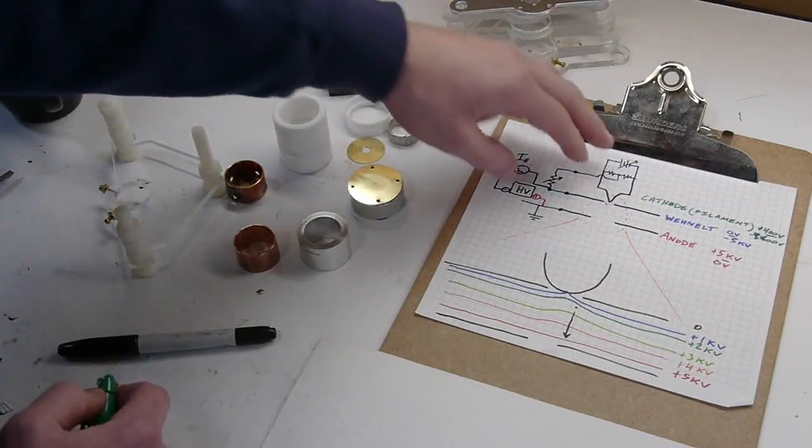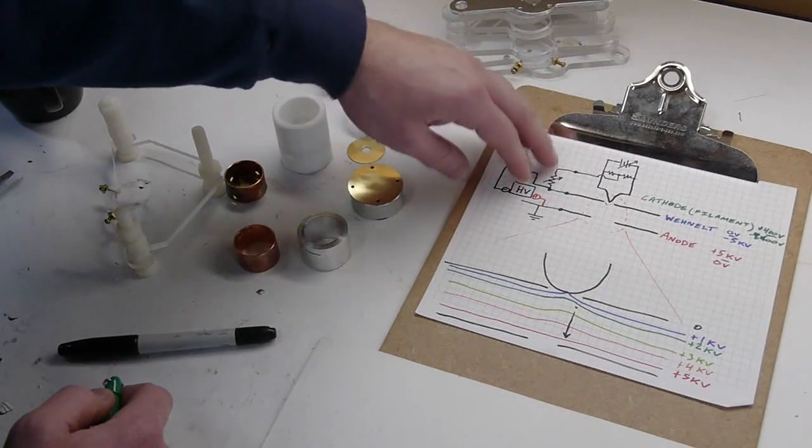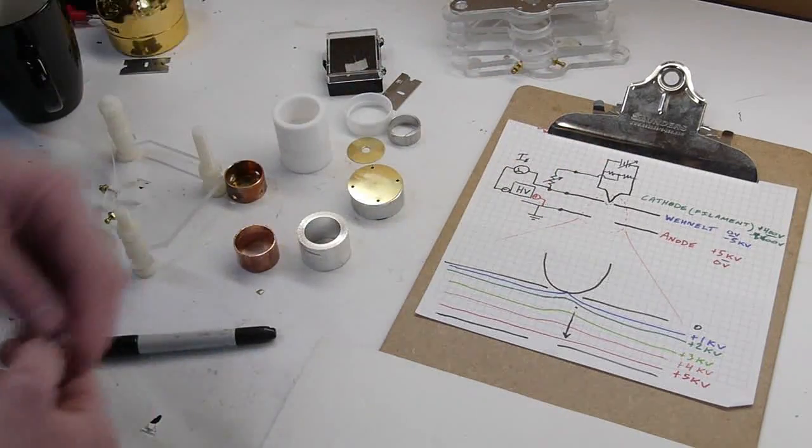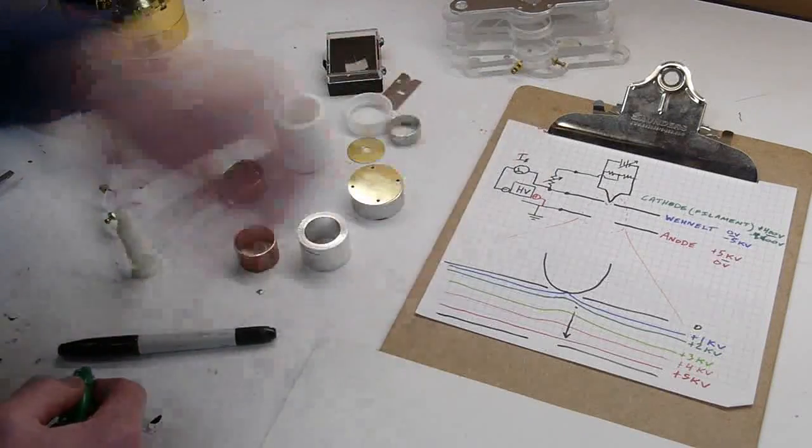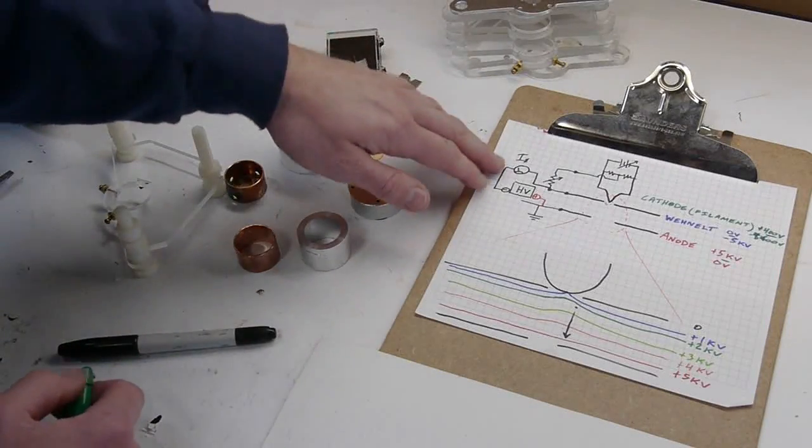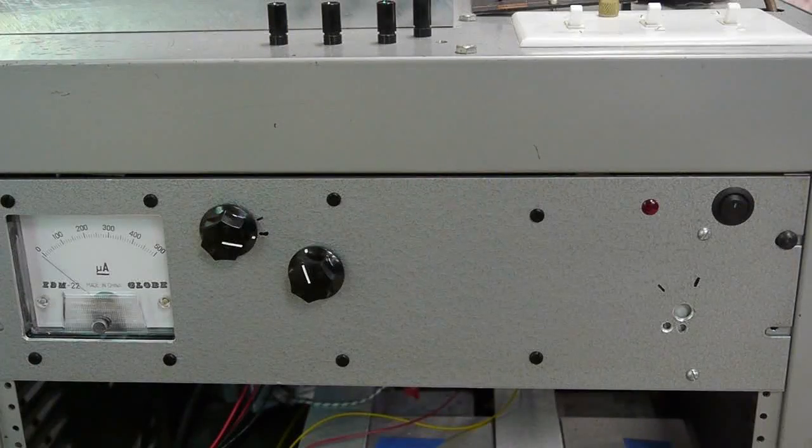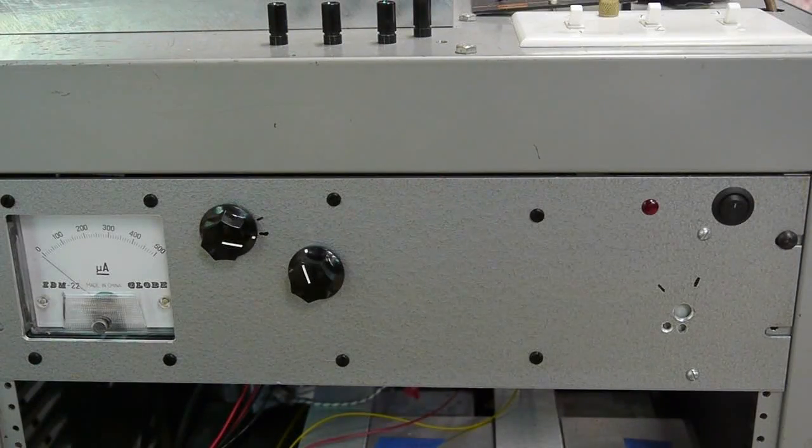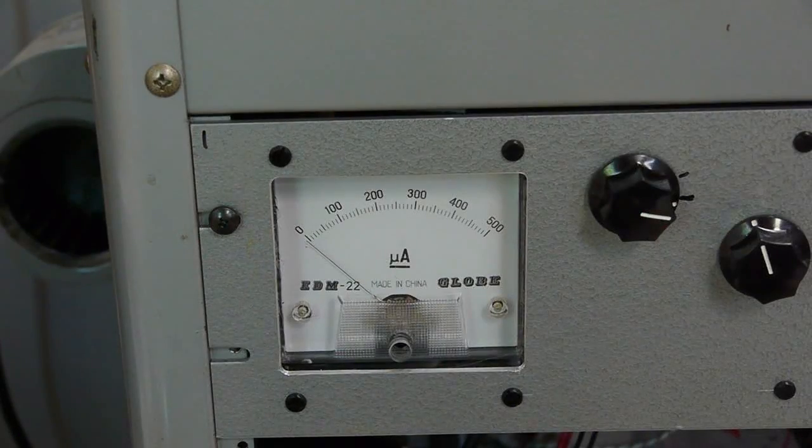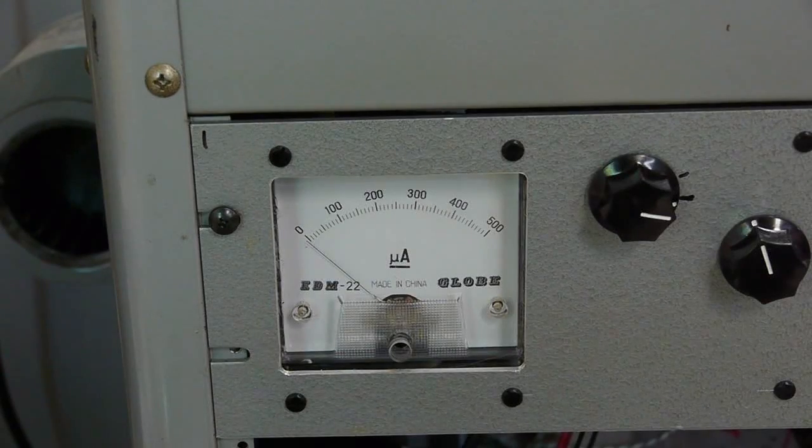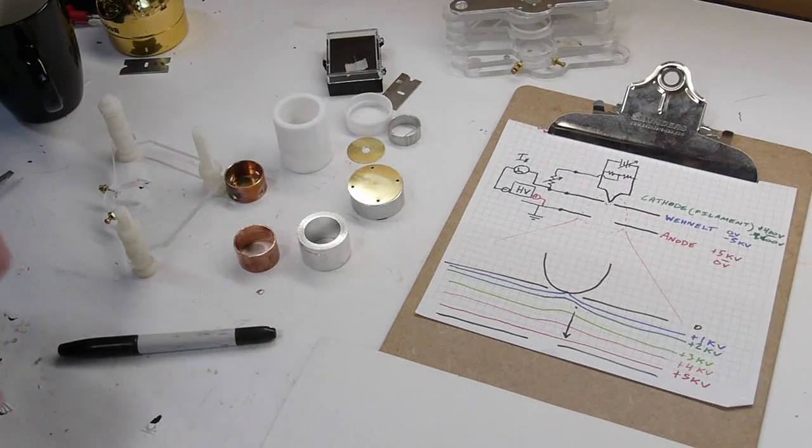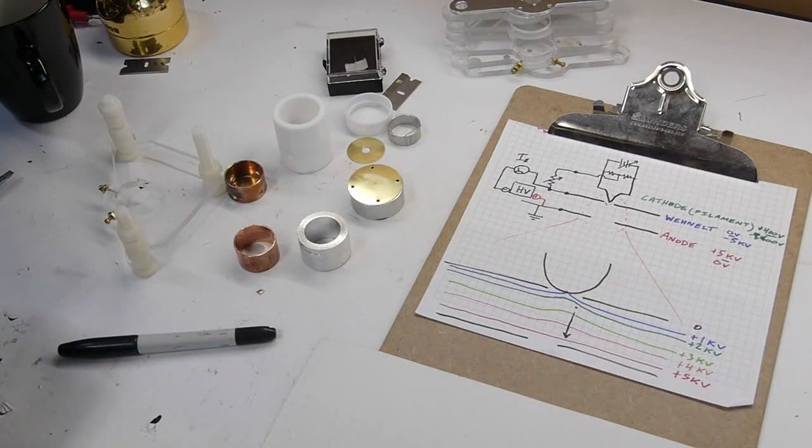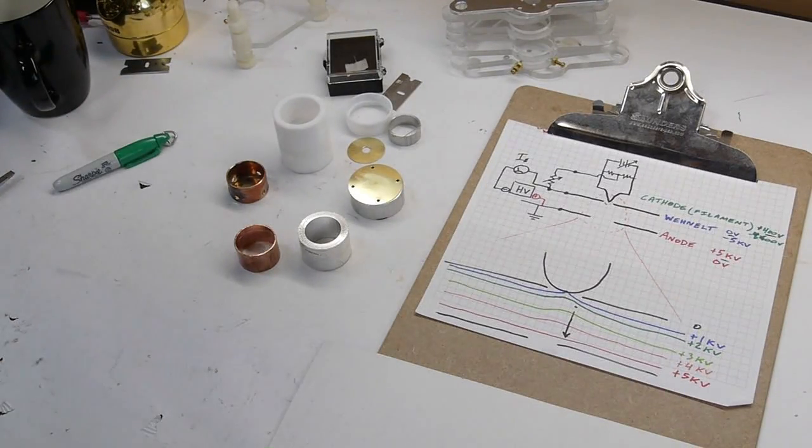So some round numbers for you: I think the cathode is normally about 400 volts higher than the Wenelt. I don't actually know, because in my system it's not measured. I'm just using this resistor. But you do want to know the emission current, so I have that microammeter which shows how much current is actually going into the cathode. And that tells you how many electrons are being emitted from there.